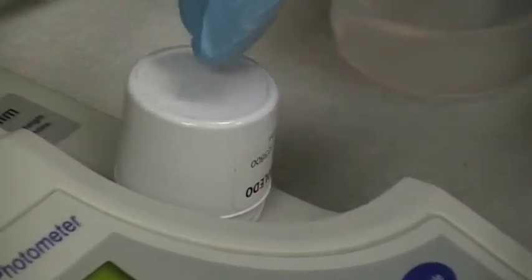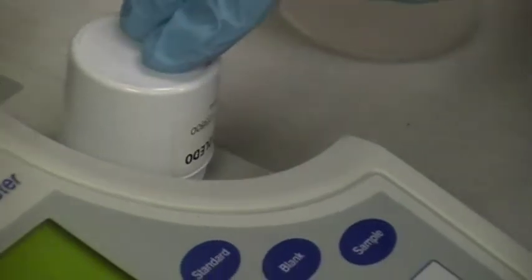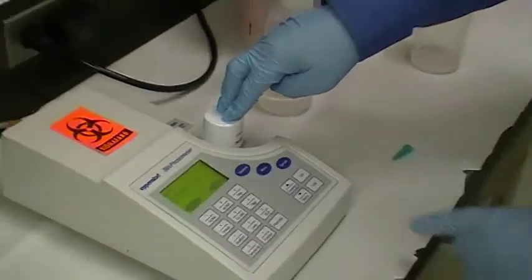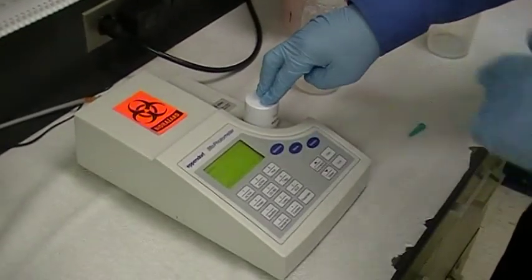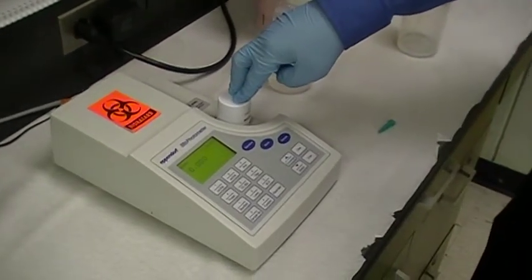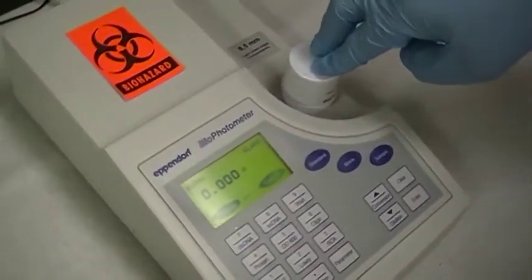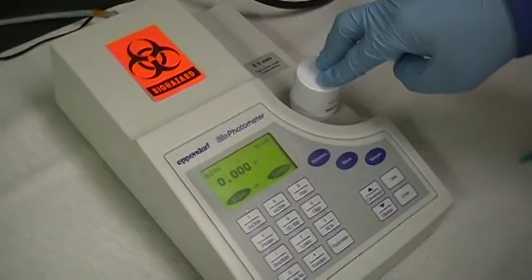So, you put some water in here or whatever your blank is and you stick it in here and then you cover it up with this lid right here. Now, the lid is not very tight so you have to push down on it. Now, before you read your DNA, you press blank. And it's going to read 0.000.